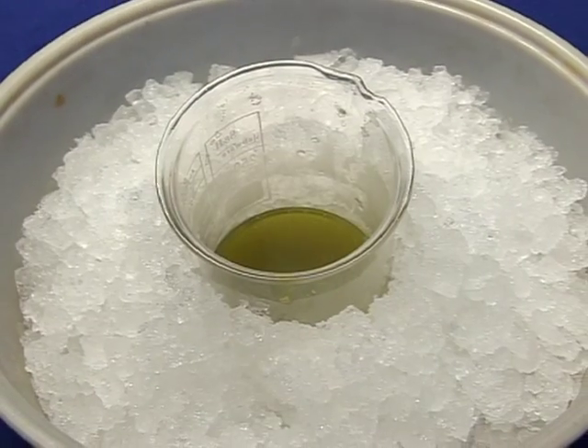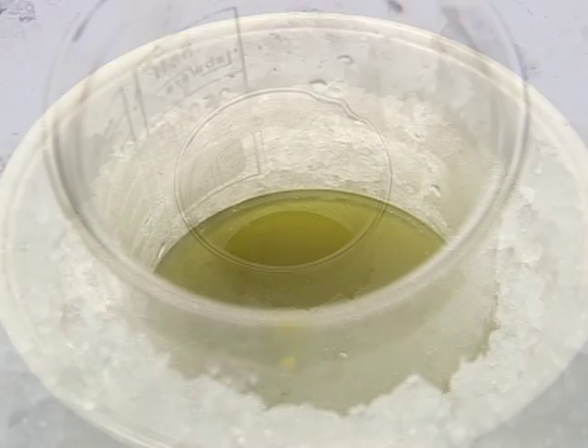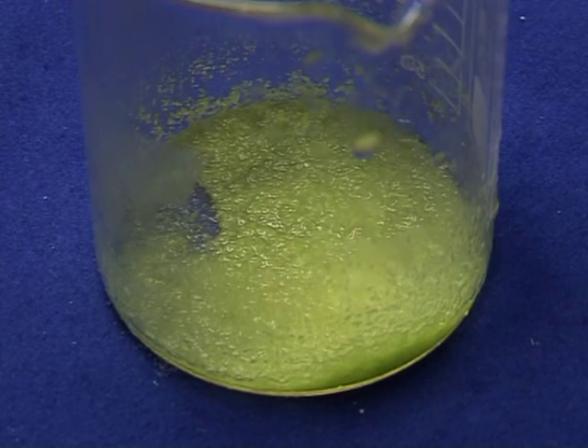Allow the product to crystallize by cooling the solution in an ice water mixture. Collect the crystalline output by filtration. The product is potassium trioxalatoferrate trihydrate.